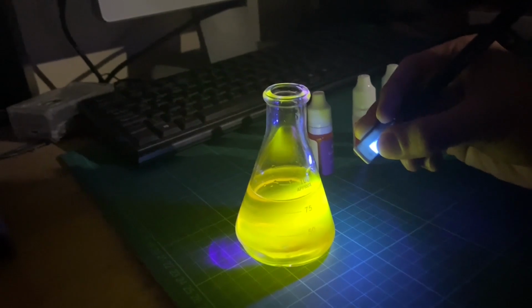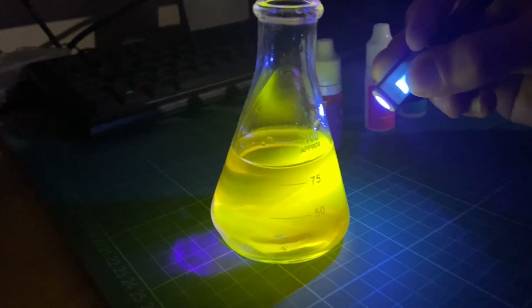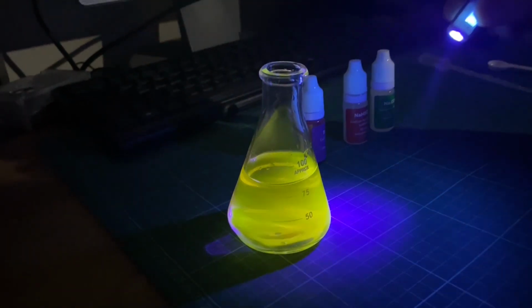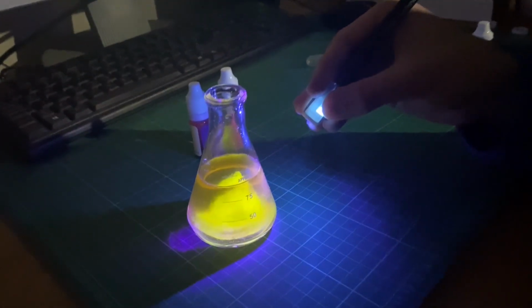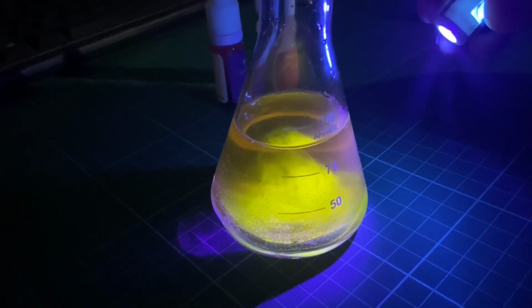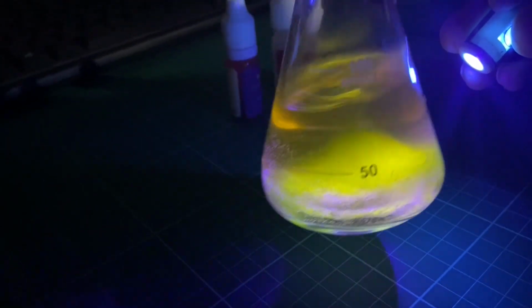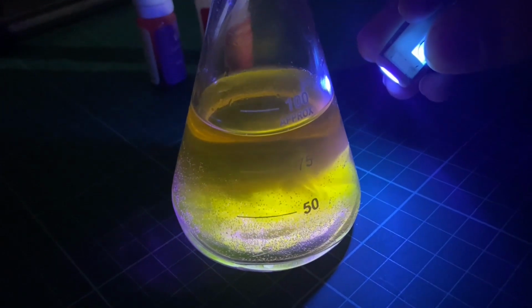Hello, in today's video we'll be exploring ultraviolet light. The UV spectrum refers to the portion of the electromagnetic spectrum that's shorter than visible light but longer than X-rays in wavelength, ranging from 10 to 400 nanometers in length. As we will show in these experiments, it can cause fluorescence in certain materials, which has multiple uses in science.